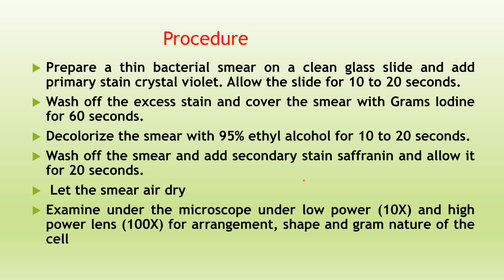Let the smear air dry. So after the addition of safranin we need to allow it for 20 seconds. After 20 seconds we need to wash off the excess stain and air dry the smear. So now after air drying we need to go for the observation.